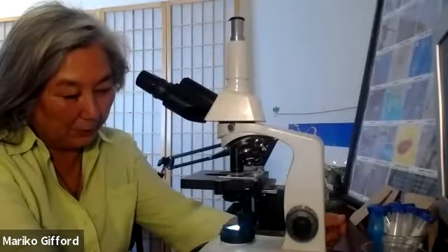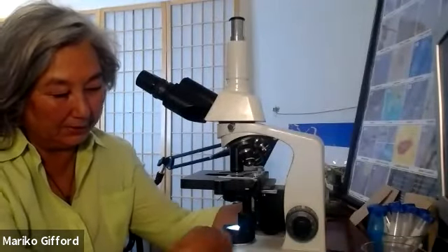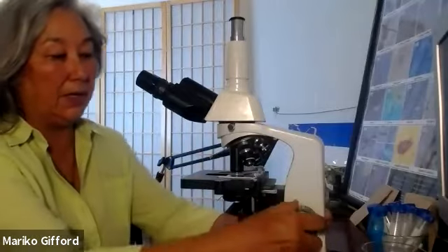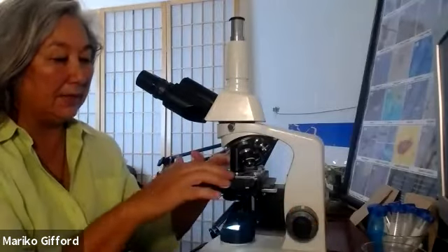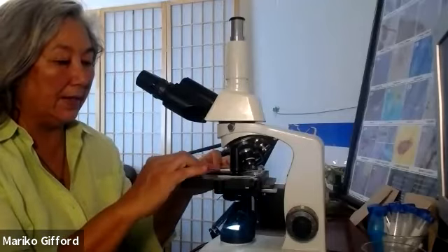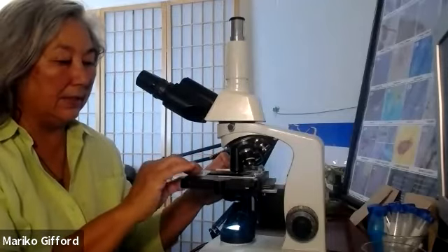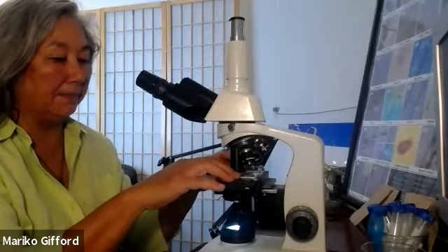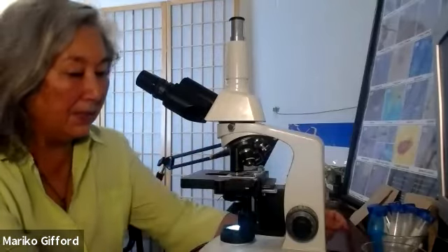So here's my microscope. I've calibrated it. I have the stage all the way up. I actually have a slide in here that I was already looking at. So it's a prepared slide. It's of some compost that I have.